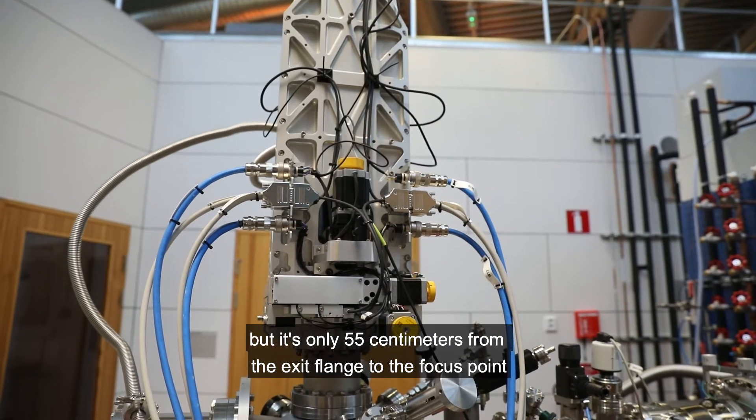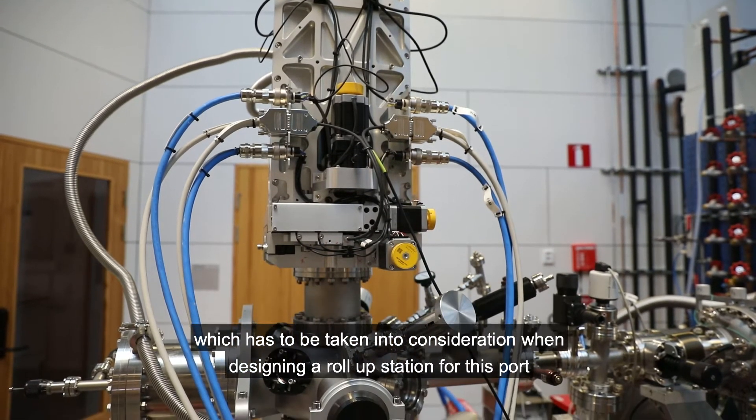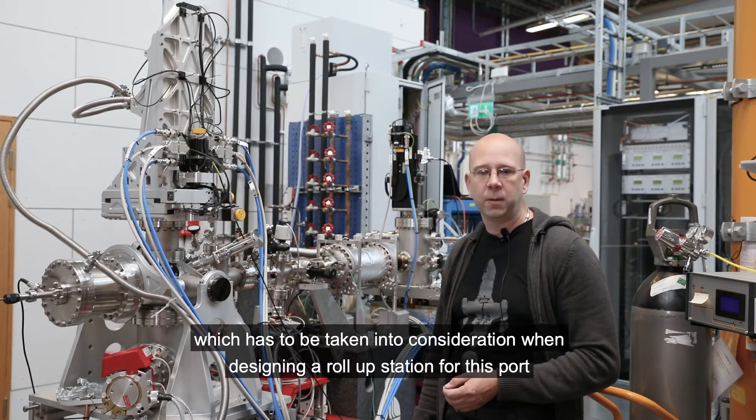It's only 55 centimeters from the exit flange to the focus point, which has to be taken into consideration when designing a roll-up station for this port.